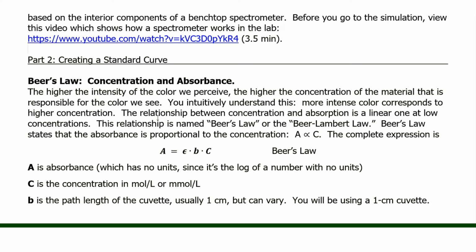And then part two, you're creating a standard curve, and this is where Beer's law comes into play. What Beer's law has to do with is concentration and absorbance. So it relates the two. So you get an equation because of that. Beer's law is an equation.